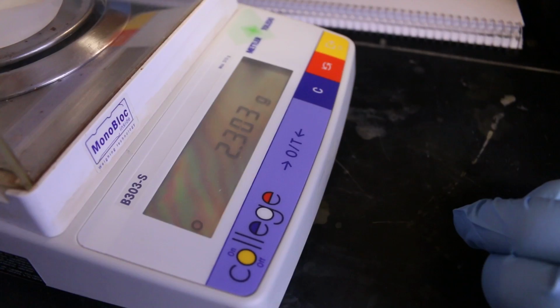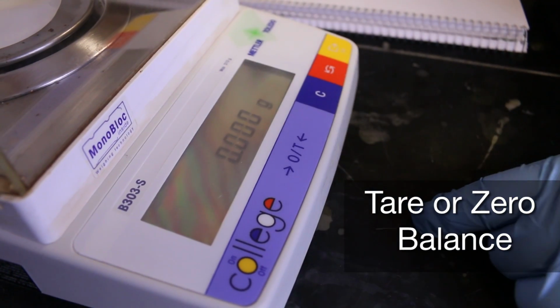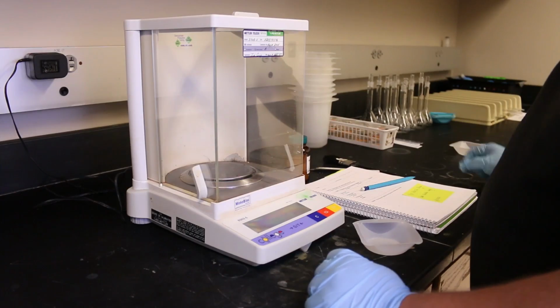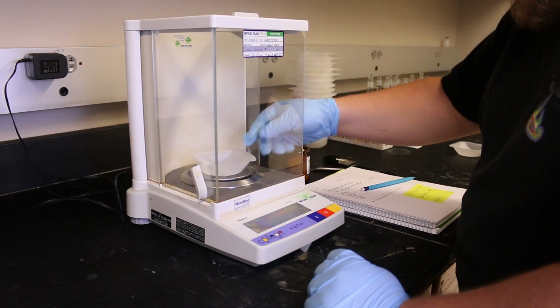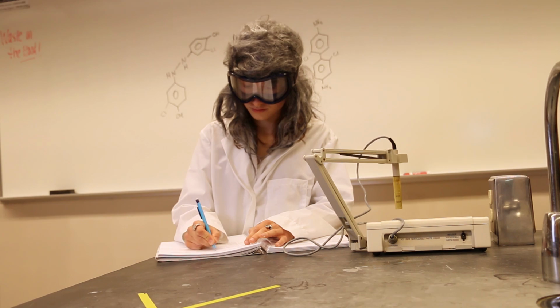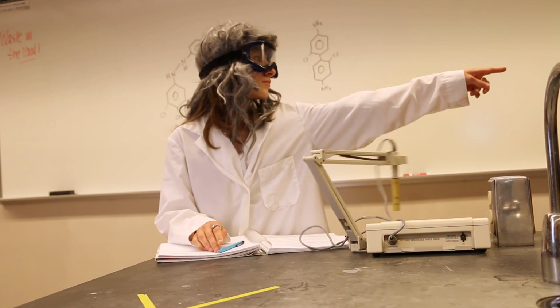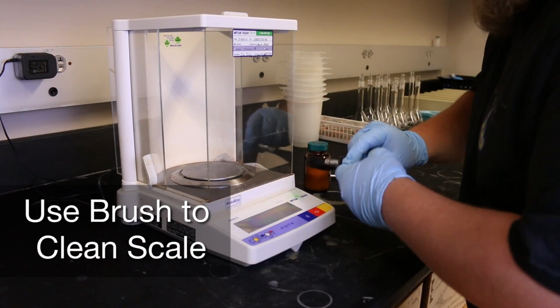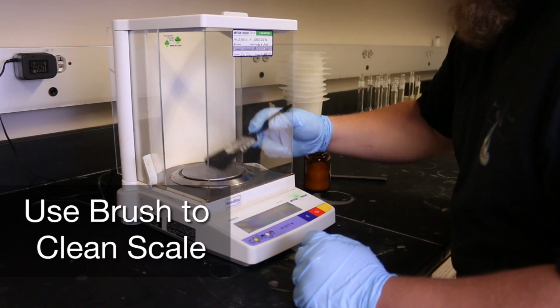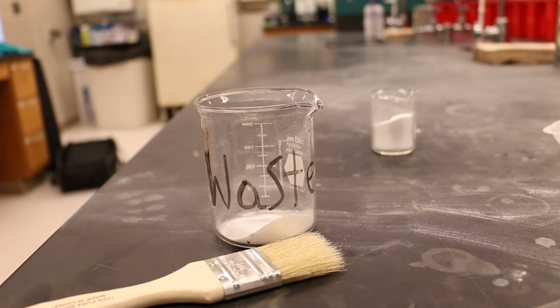When you weigh a solid, it's important to tare or zero the balance with the weigh boat, weigh dish, or weigh paper on the balance pan. This is done so you don't have to subtract the weight of the weighing vessel from the solid you measure. Your instructor will review this the first time you need to weigh something, but it should become a common part of your procedure when using a balance. If you spill solid on or around the balance, use the brush to clean up the mess. Solid chemicals should go into a waste container unless your instructor specifically states that it can go to the trash.